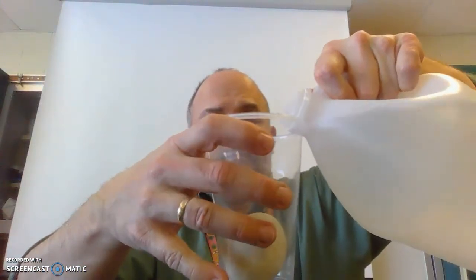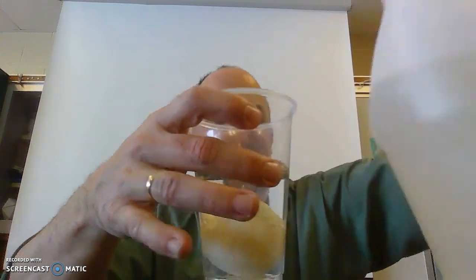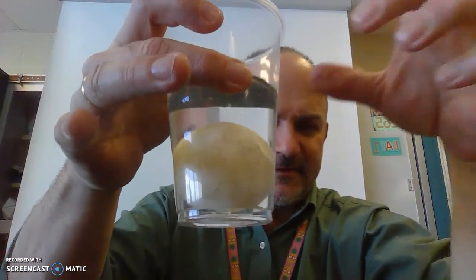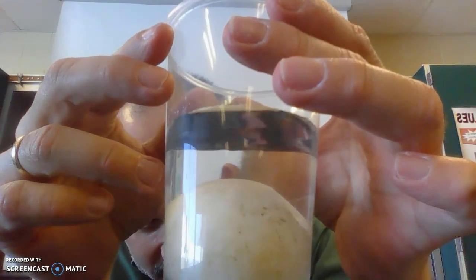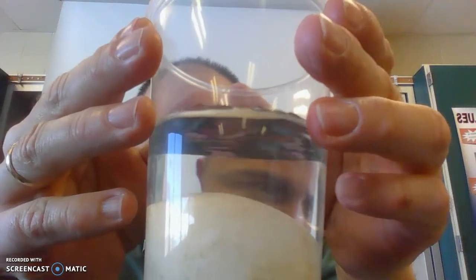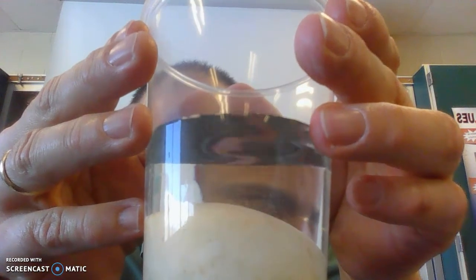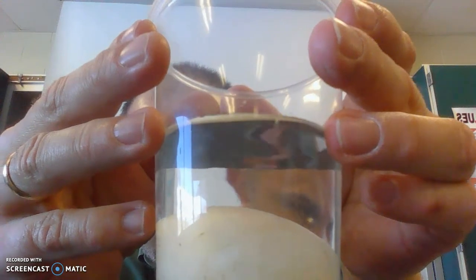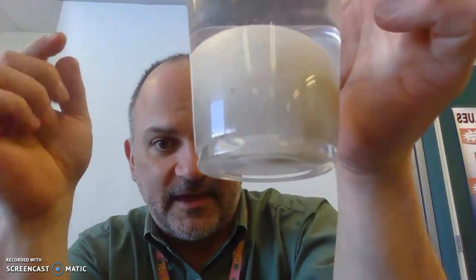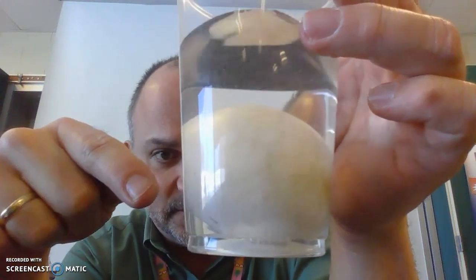And so I'm going to pour vinegar in until the egg is submerged in the vinegar. I'm going to do some observing. What do we notice about the egg in the vinegar? I don't know if you can see along the edges of it, bubbles are forming. And those bubbles are rising to the top. Okay. And also you'll notice that the egg sunk to the bottom in the vinegar. It's touching the bottom, so it's sunk to the bottom. So those are some observations for you.